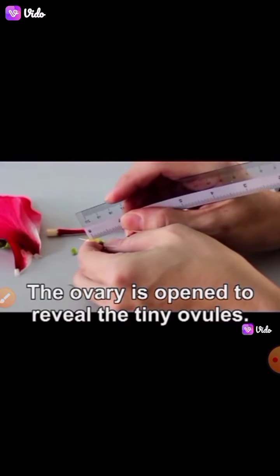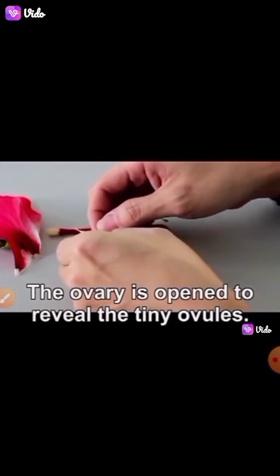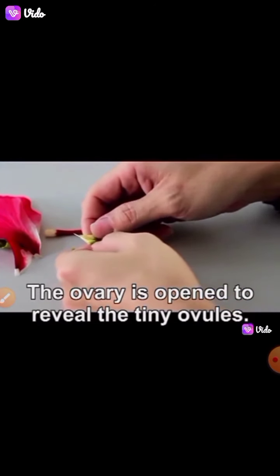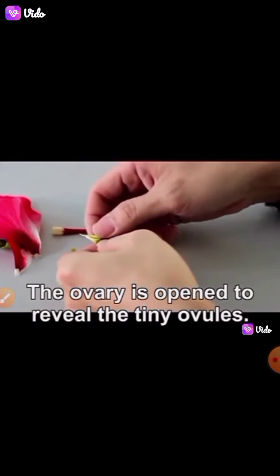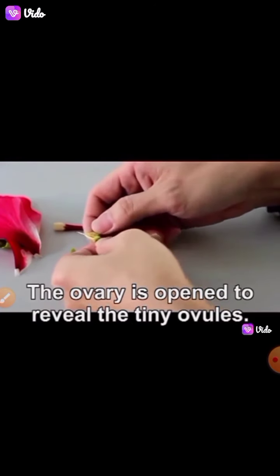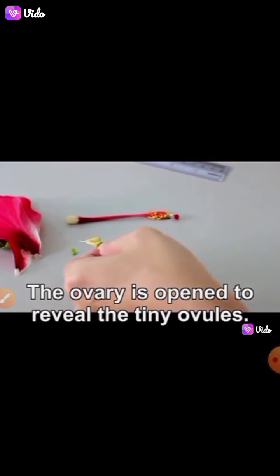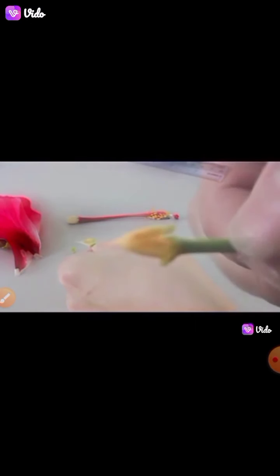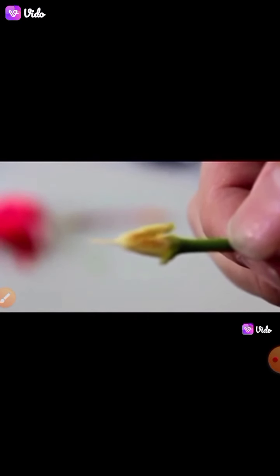As it is small, our little mistake will ruin all our work. So now the ovary is open to reveal the tiny ovule. As I already told you, the ovule is present inside the ovary. The mature ovule is called seed and the mature ovary is called fruit. Yes, do this work very slowly, very carefully. You can see this picture, and this is the ovary.